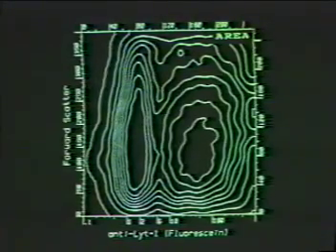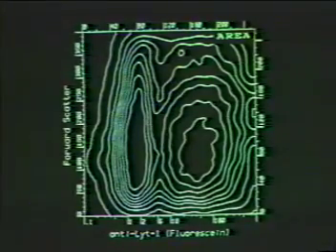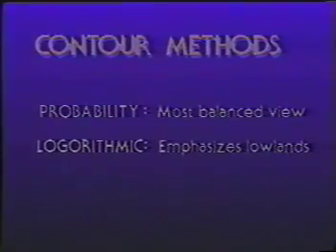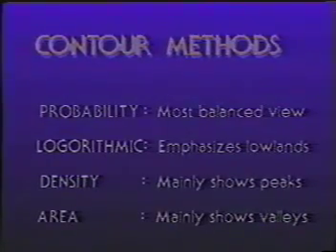The valleys, on the other hand, are clearly defined, so these maps are sometimes useful for establishing cell sorting and integration boundaries. Choosing the appropriate contour map depends on your data and which subpopulations you are interested in revealing. Each type of map has its use. In general, it's a good idea to first call up a probability map so that you can get a clear picture of the overall features in a landscape.